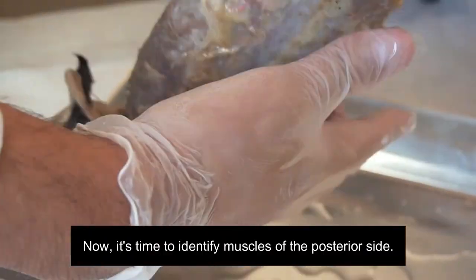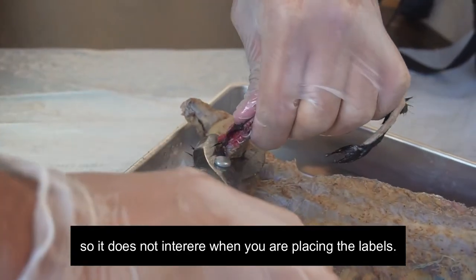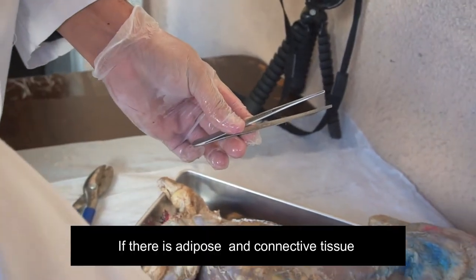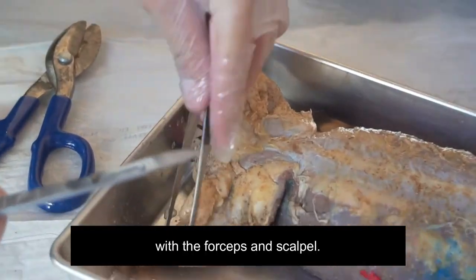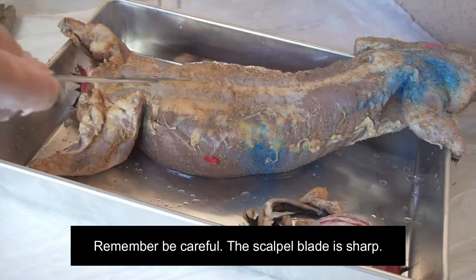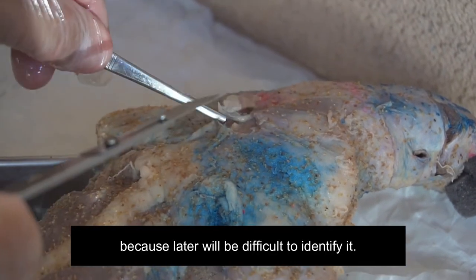Now it's time to identify muscles on the posterior side. My suggestion is to cut the mink tail so it does not interfere when you are placing the labels. Please be careful — it is an extension of the vertebral column, so it could be hard to cut. If there is adipose and connective tissue covering muscles, please remove them with forceps and scalpel. Please be careful. I am removing excess adipose tissue. Remember, be careful — the scalpel blade is sharp. Just be careful not to make a deep cut into the muscle, because later it will be difficult to identify.